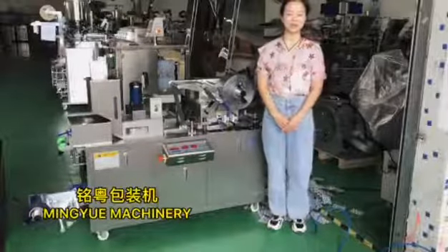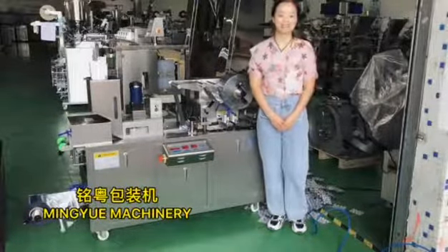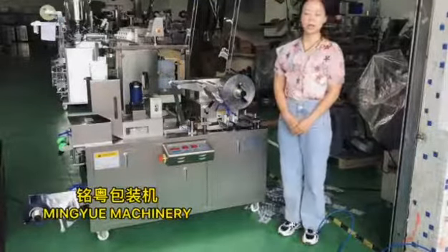Hello everyone, this is Ella. I am from Hong Kong. I am making a package machinery company. Today I am going to introduce our mini-tab release-packing machine automatically.